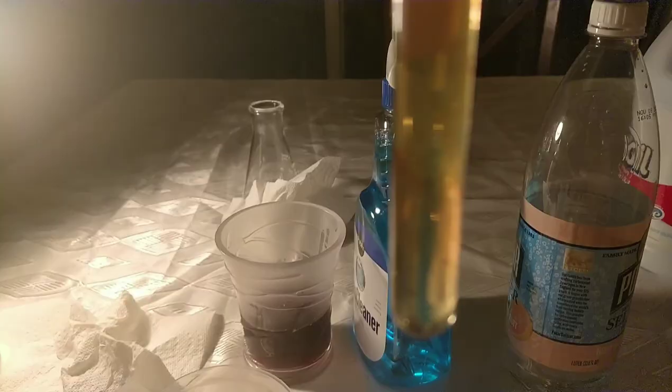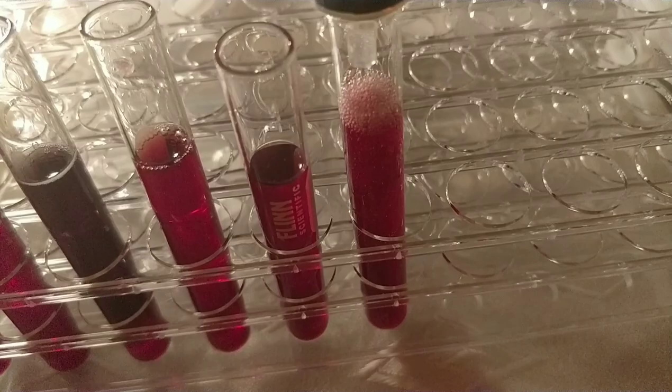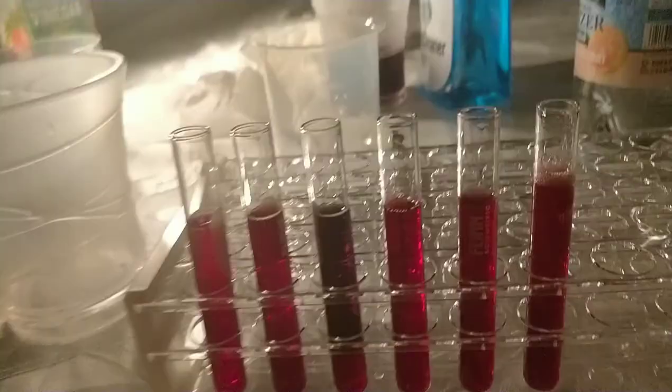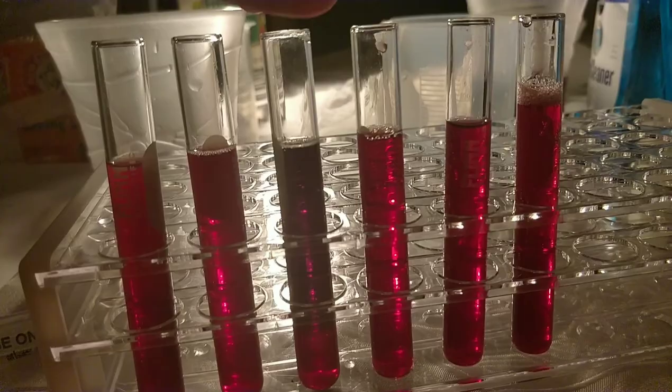Our final test will be with the seltzer water. I replaced the bleach test tube with the seltzer water — it also remains purple. As you can see, the only one with any real change was the baking soda.